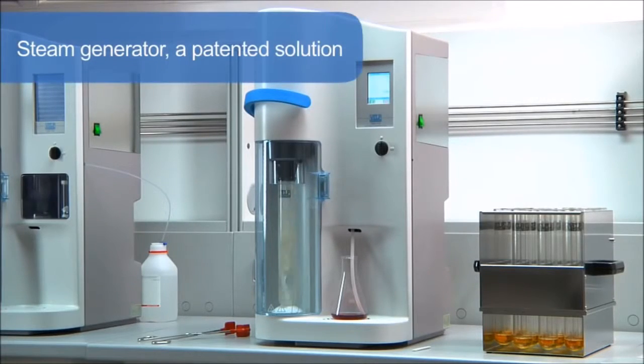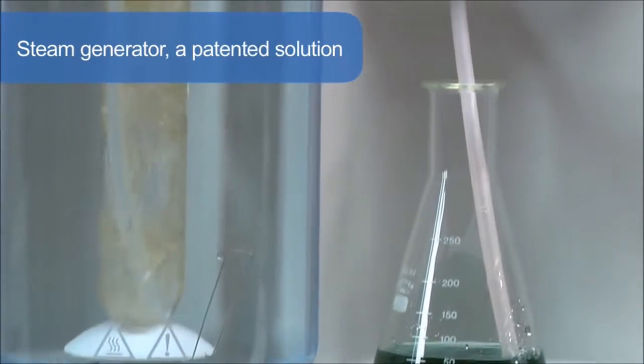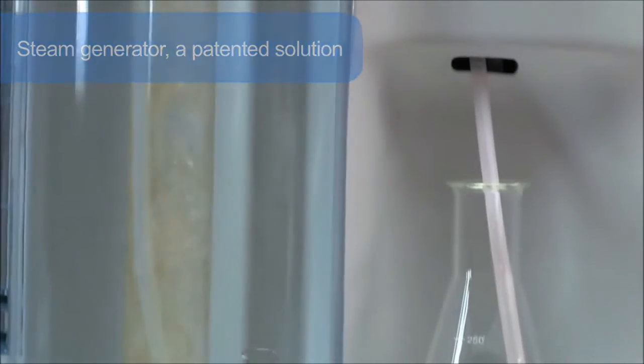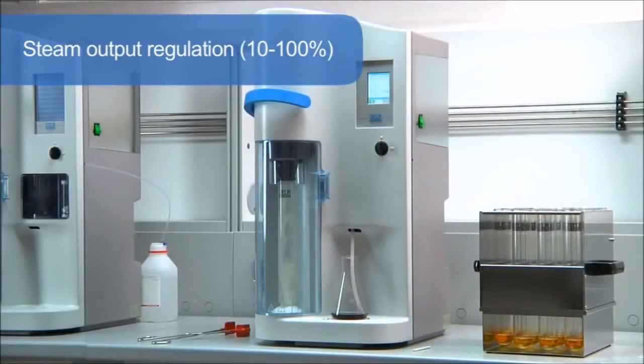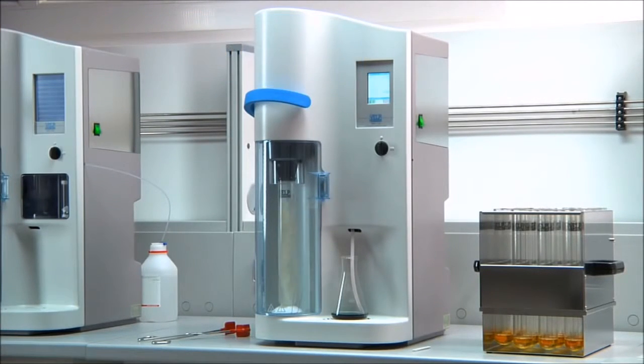The steam generator is a patented solution and offers unique performance as it operates without internal pressure and is completely maintenance-free. Thanks to the steam output regulation, 10 to 100%, the UDK 149 is recommended for many applications, including alcohol, volatile acids, phenols, sulfites and TVBN determination.